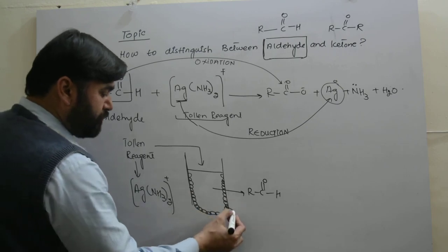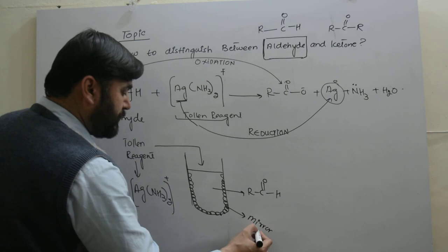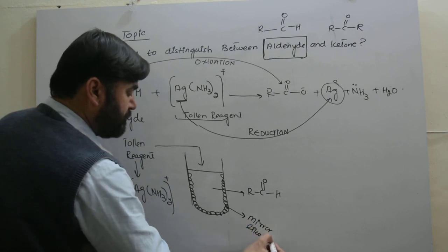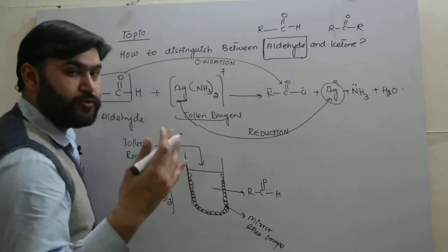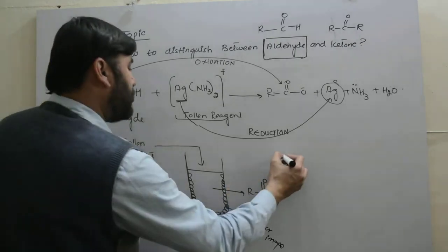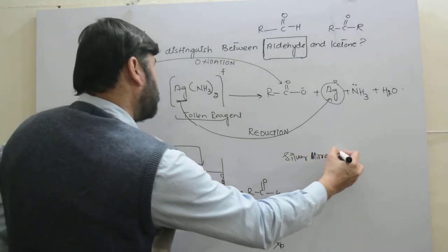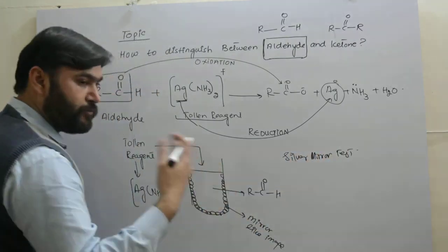So, it will make a mirror-like image in which you can see your face. That is why it is called the silver mirror test.